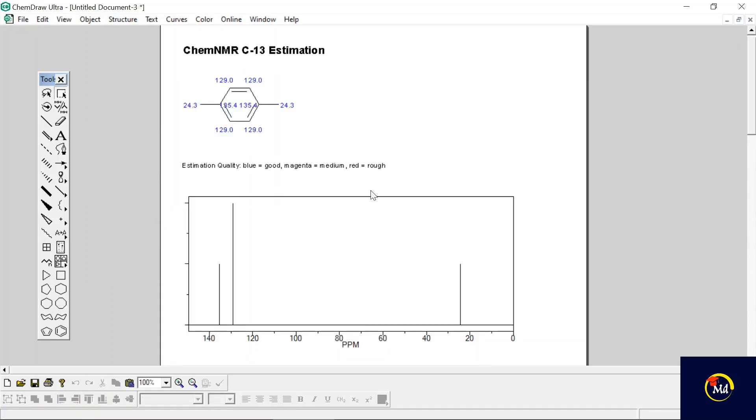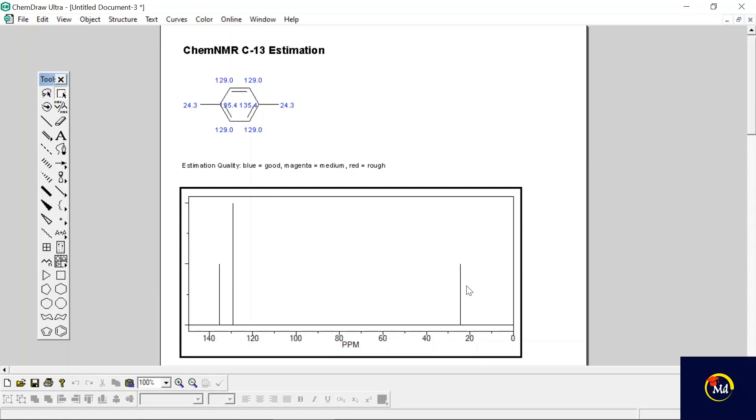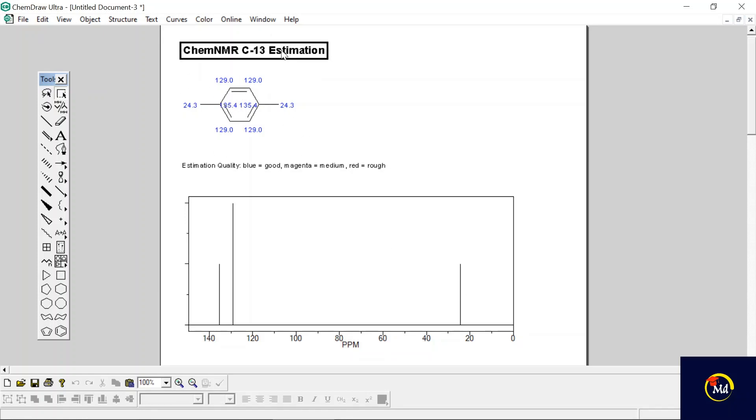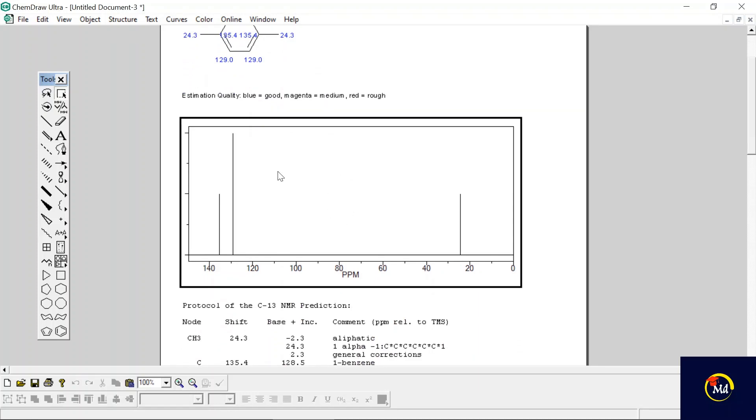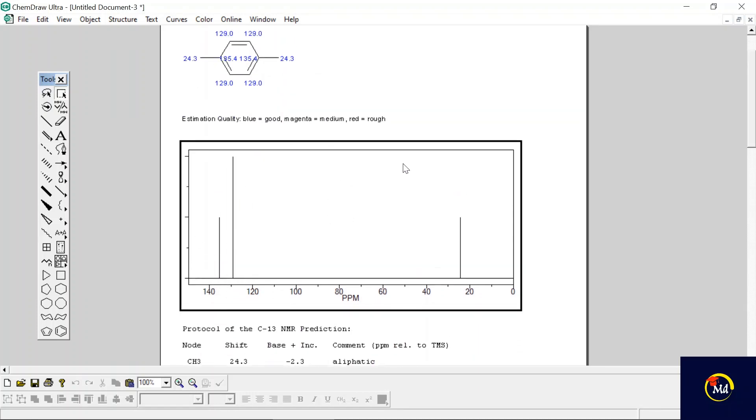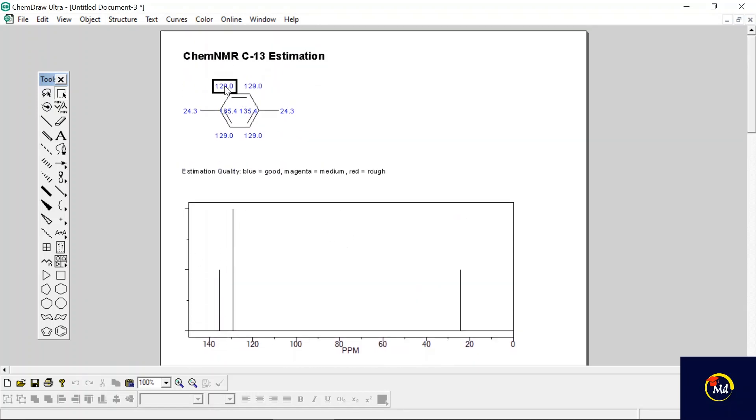You can see there are three shifts obtained in carbon-13 NMR shifts of para-xylene. These are the shifts obtained, and all the shifts are mentioned here.